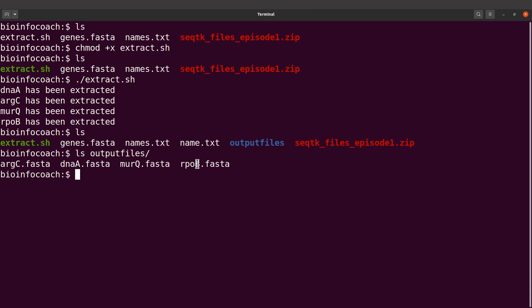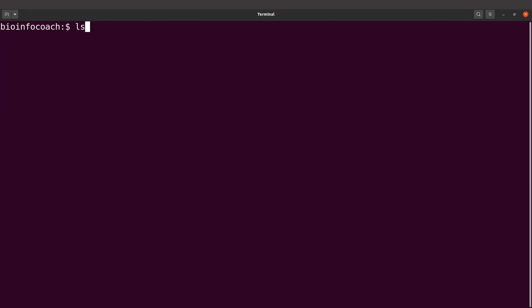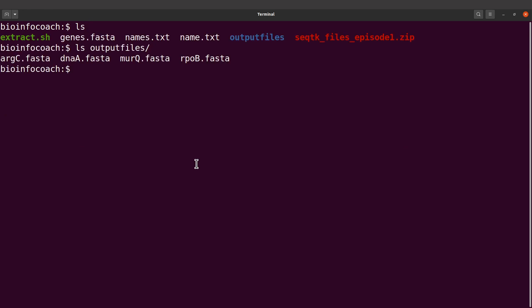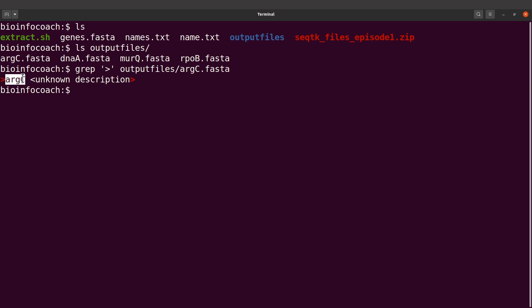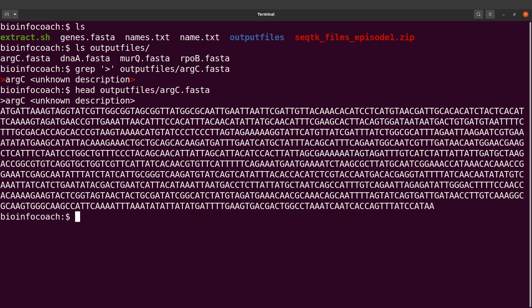Now let's just confirm. We'll do a quick search — let's look at this one, for example, and take a look at the header. We can say grep and specify output_files/ac.fasta. We find it there, which means everything has been done successfully. Let's also look at the sequence itself. So this is how we extract sequences to separate output files.